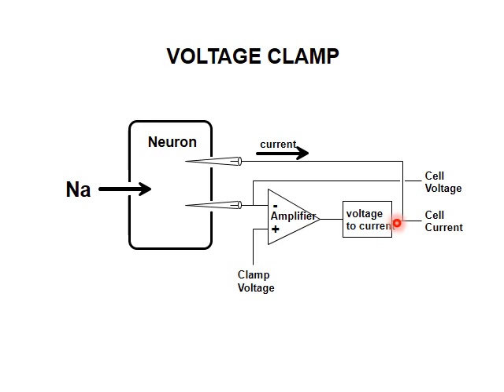So this negative current is then applied to the second electrode, the current injecting electrode. A negative current injecting negative charges into the cell will hyperpolarize the cell and will lower the voltage from +5 until it gets down to 0, which was our desired voltage, at which point the electrode will measure 0 millivolts going into the negative input. We have applied +0 millivolts to the positive input, and therefore 0 volts will come out, and then we will be injecting no more current.